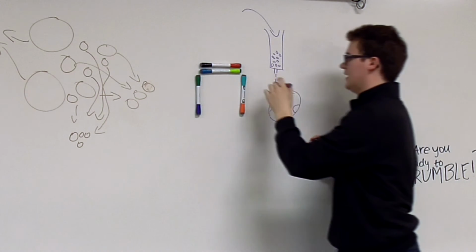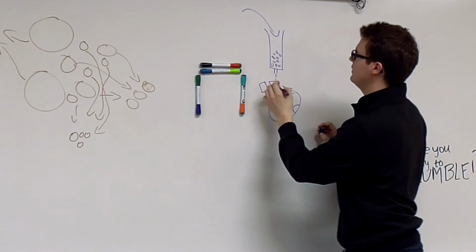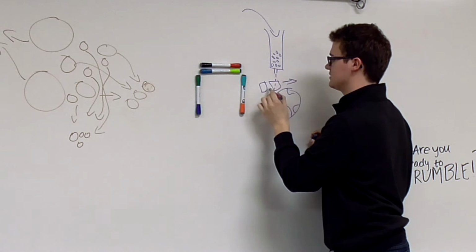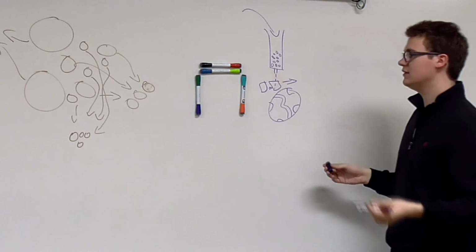And you would expect to have a vial to catch so many drops right here. And after you catch so many drops, this is kind of a slow procedure, you would shift it away and send the next one into that spot to collect the next few drips. Why would you be doing this?